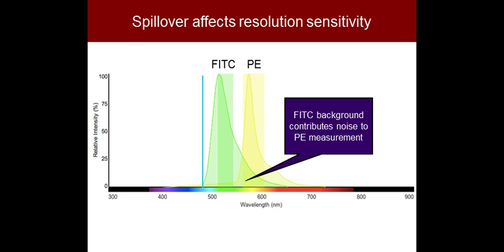And by the way, this is a nice web tool that you can use to look at these sorts of things, and they're available from multiple suppliers. This one happens to be the Life Technologies web tool for picking filter sets and looking at fluorochromes and spillovers.